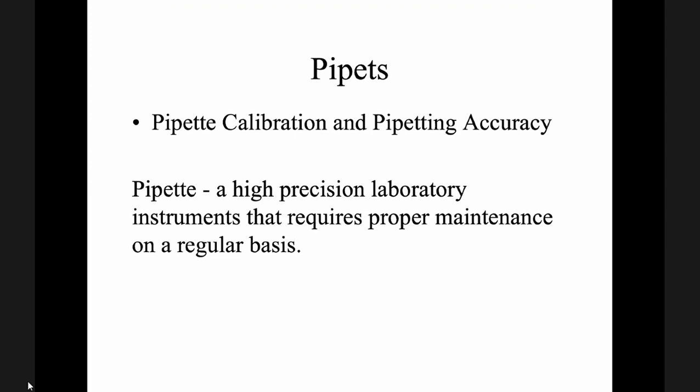Okay, so your first lab activity this afternoon will be calibrations of laboratory glassware. So you will calibrate the pipette and also burettes and also a volumetric flask. Okay. So a pipette is a high precision laboratory instrument that requires proper maintenance on a regular basis.